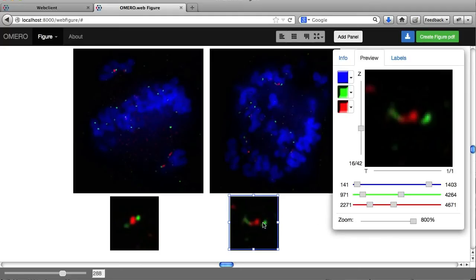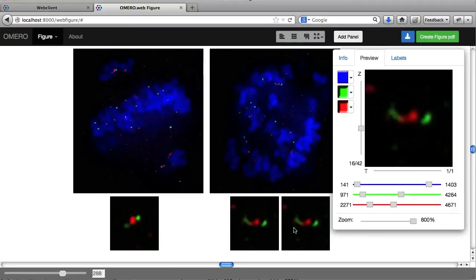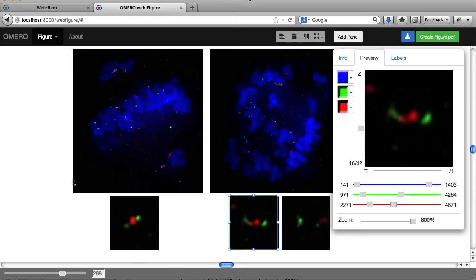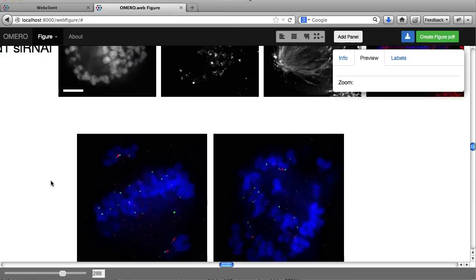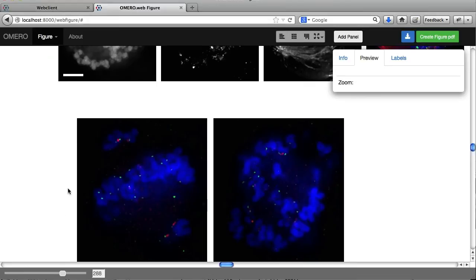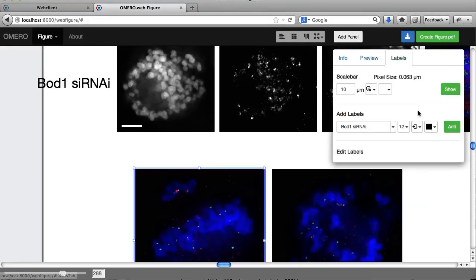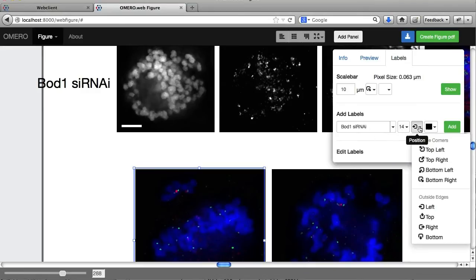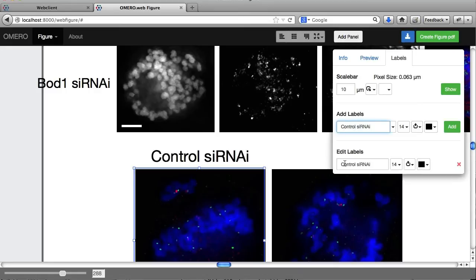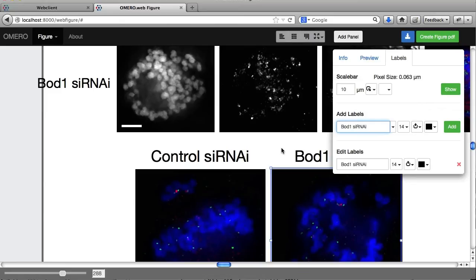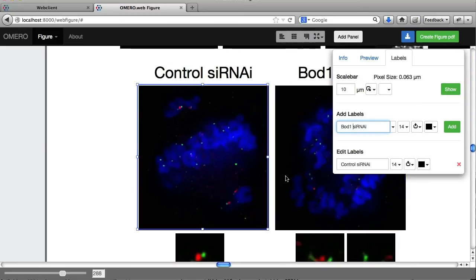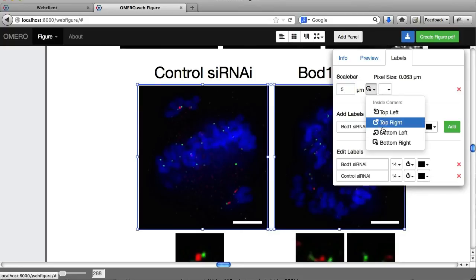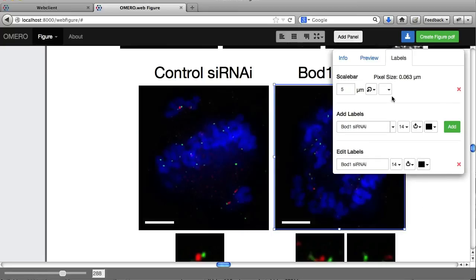And there's another one. I could copy this one. Copy and paste that on there and move that to a different location if I wanted to. Let's just add what we're going to do. Add a label. Let's go size 14. Add to the top of this one. Control siRNAi. And the next one over here. Bod1 siRNAi. Let's add scale bars to them both. Actually we don't need it on this one. Remove it from that one.